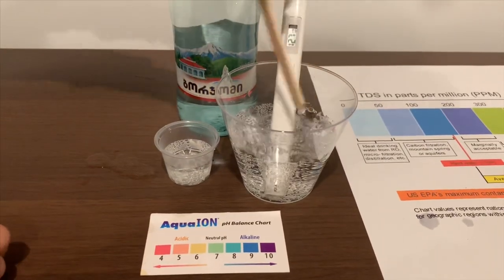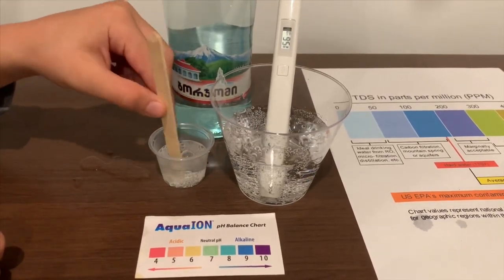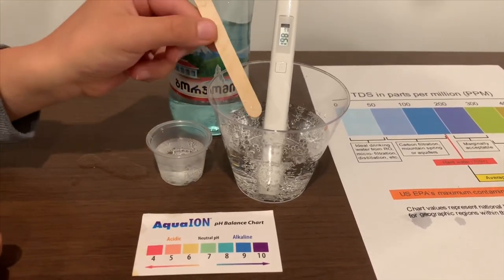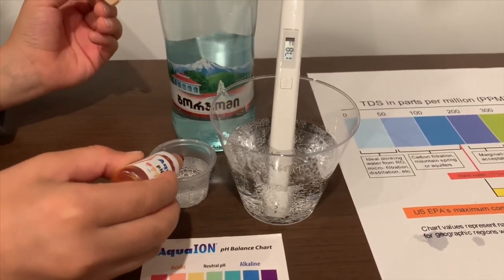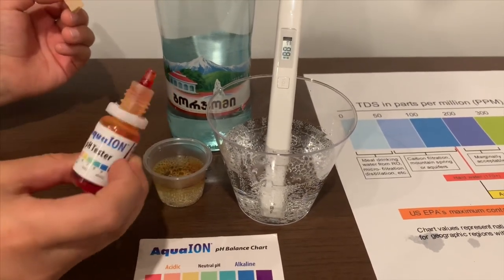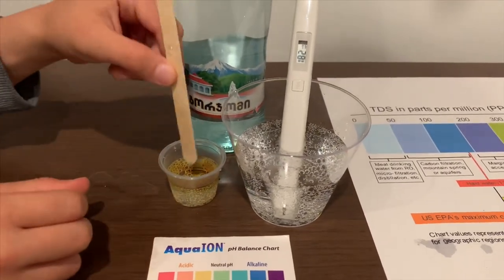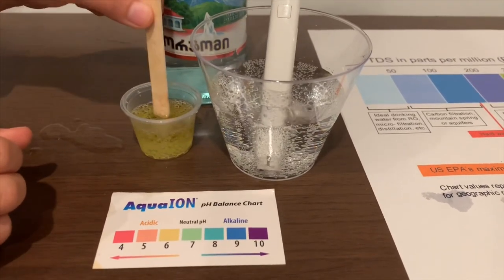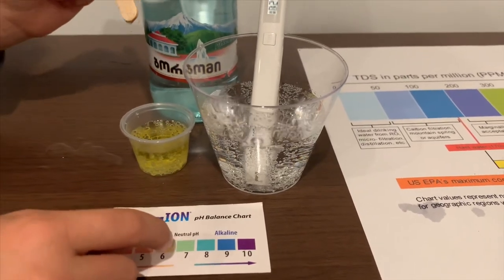Let's stir the pH cup a little too so we'll get a better result on the pH. If you want to buy this pH tester, the link is down below. Let's stir a little more. I say this is a 6.6 — that is neutral pH.